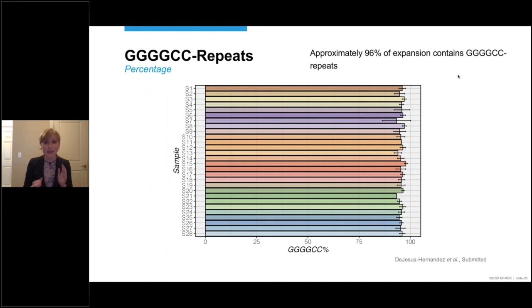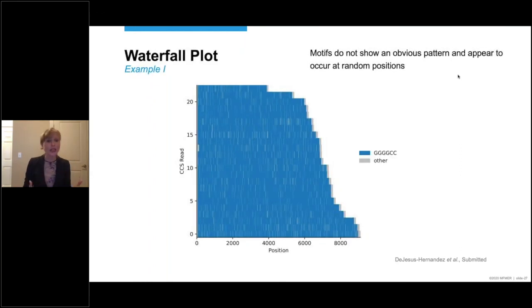You can also visualize this in a waterfall plot, as shown here on this slide. Where the CCS reads are shown on the y-axis, more than 20 for this individual. And the position, the nucleotide's position, is specified on the x-axis. If a GGGGCC motif is present, it's shown in blue, bright blue. And if it's another type of motif, it's shown in gray, as gray lines. So you do see a lot of blue here, and some gray lines. But really, there is no obvious pattern. And these interruptions appear to occur at random positions.